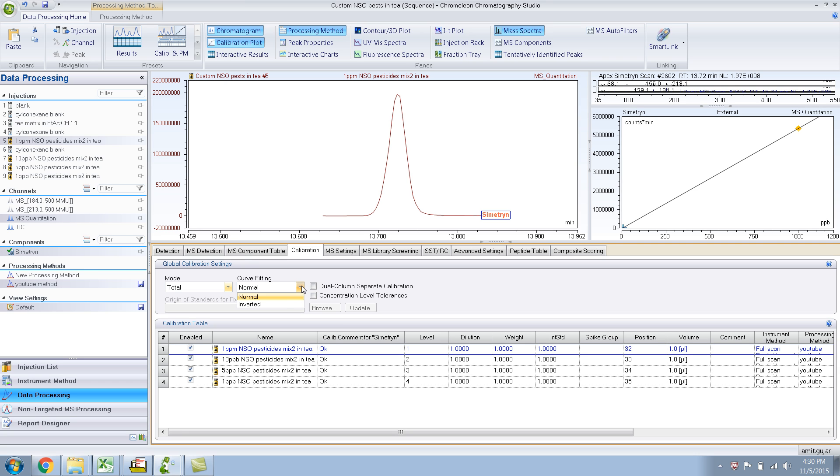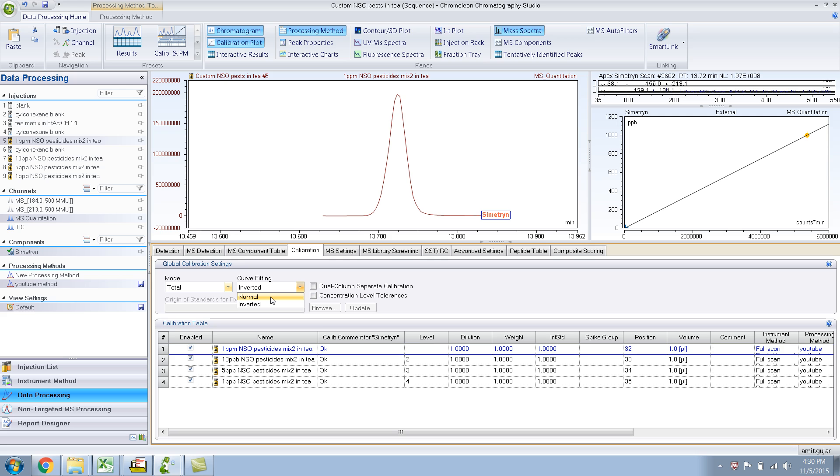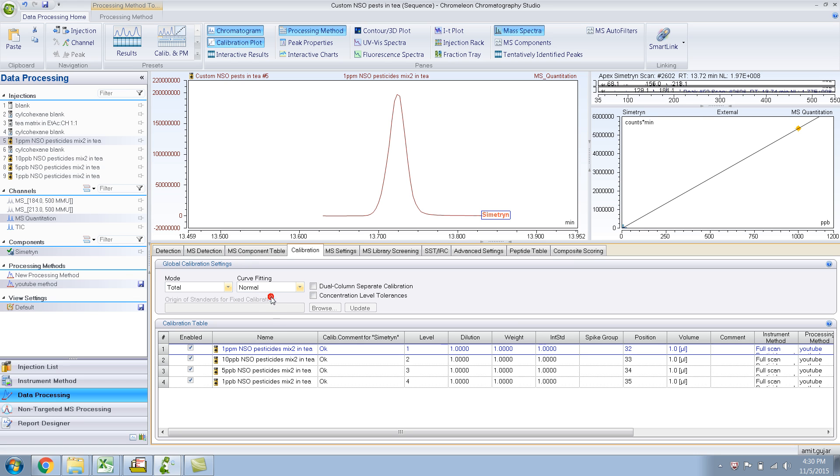This curve fitting, if I do inverted, basically it just inverts the X and the Y axis. That's what it is, curve fitting. When I think of curve fitting, I think something different, but over here it's just interchanging X and Y axis. Just remember that.